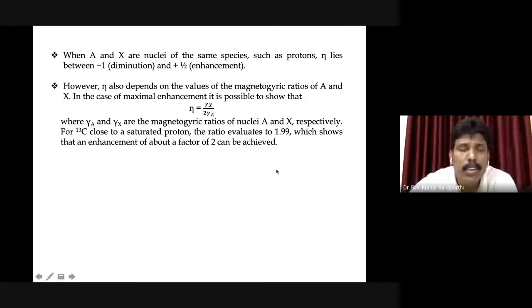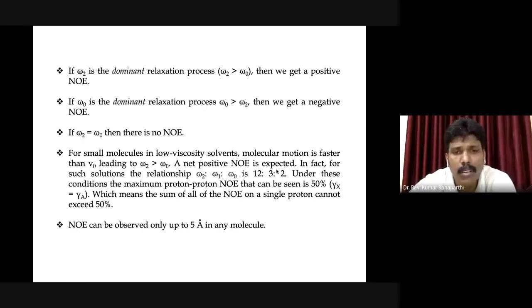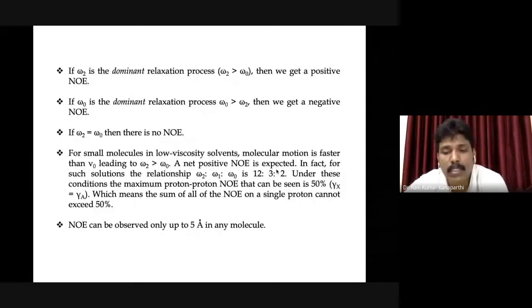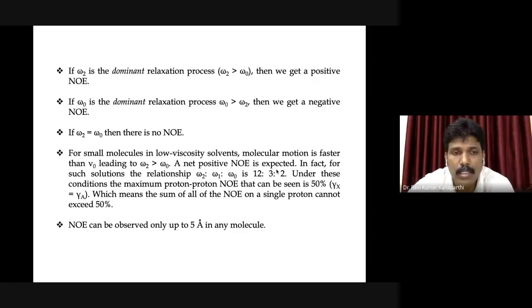And what else do I have? I think these are all already covered. One of the most important points I just missed out, but this is the right time to explain it. The NOE is a through-space interaction mechanism. It is happening because of the dipole-dipole interaction through space.